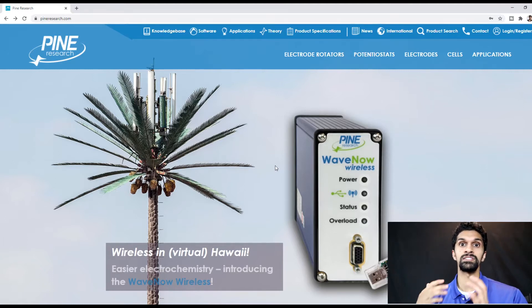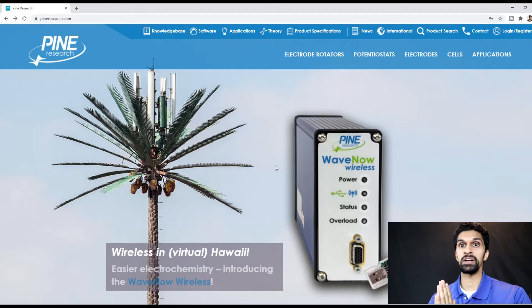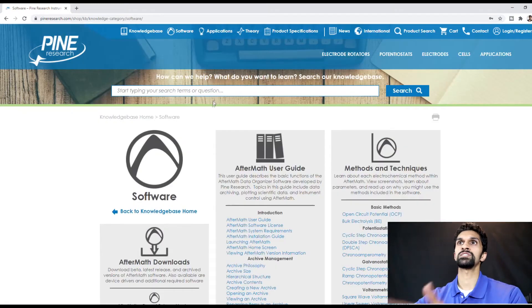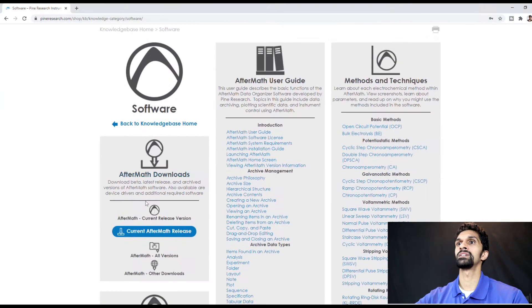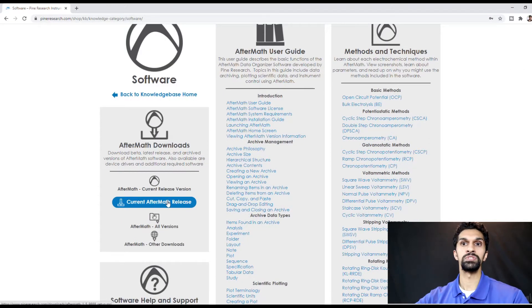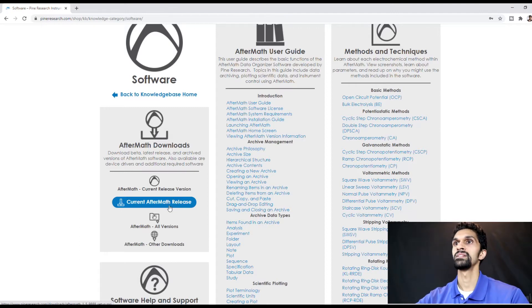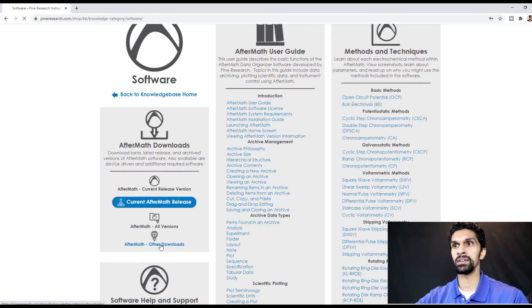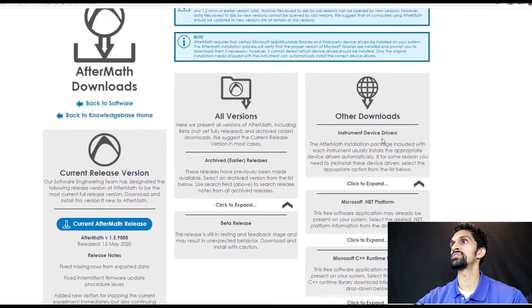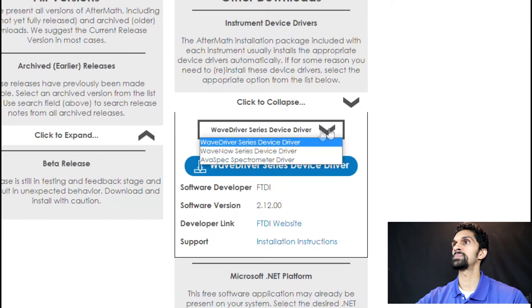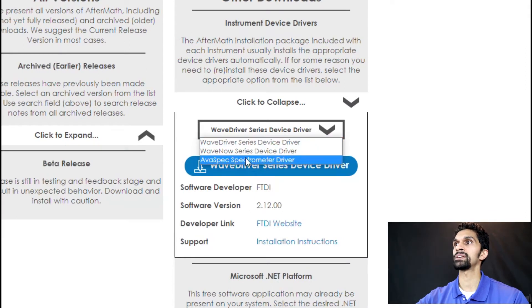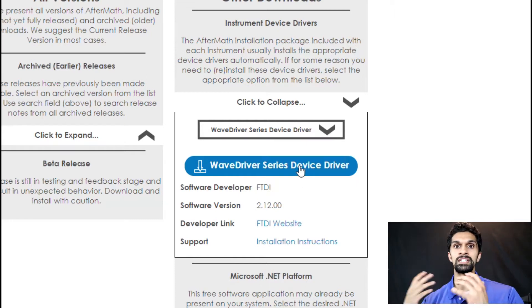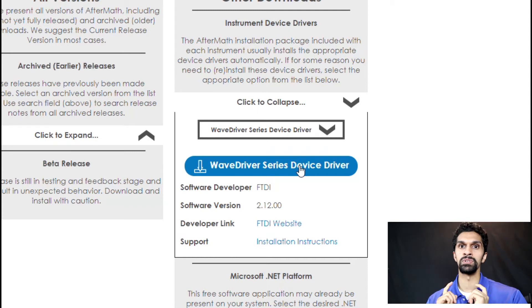If you don't have that flash stick, not a big deal. You'll be able to download Aftermath and the drivers from our website. I'm on pineresearch.com. In the upper left hand corner, go to Software and click here. It takes us to the knowledge base where you'll see Current Aftermath Release. Click on this to download the installation file. If you need any other drivers such as WaveNow, WaveDriver, or even the Avantes spectrometer drivers, go to Aftermath Other Downloads, then Instrument Device Drivers. Click this button to get the installation file and follow the installation steps.